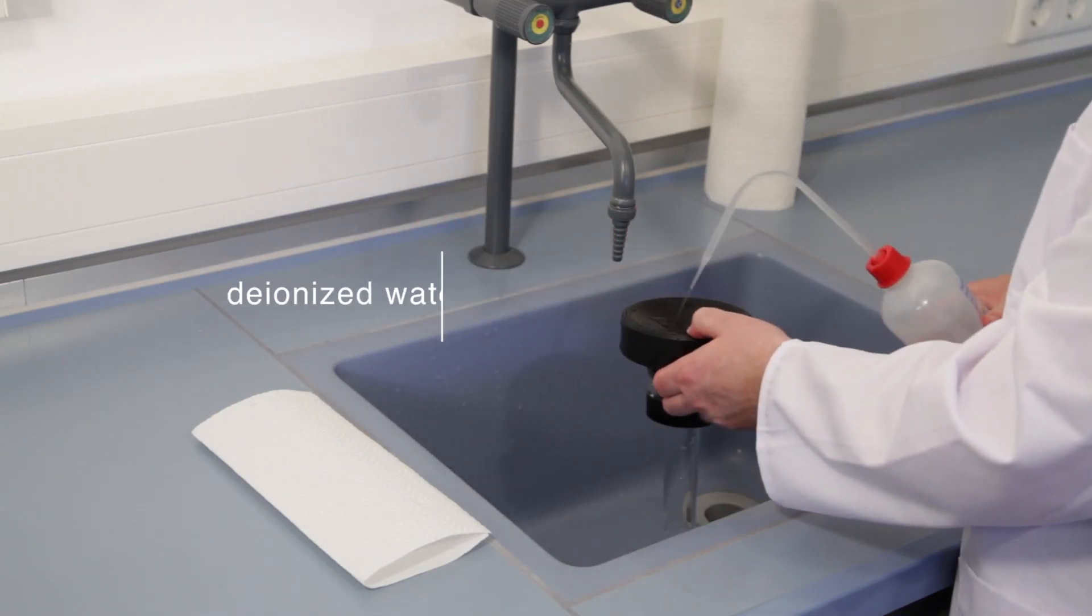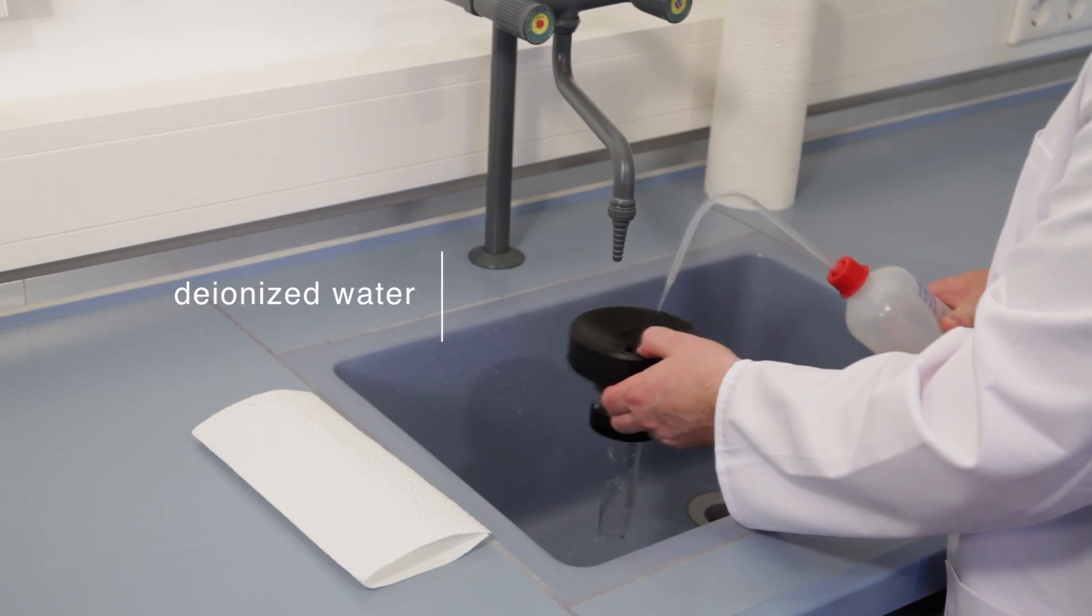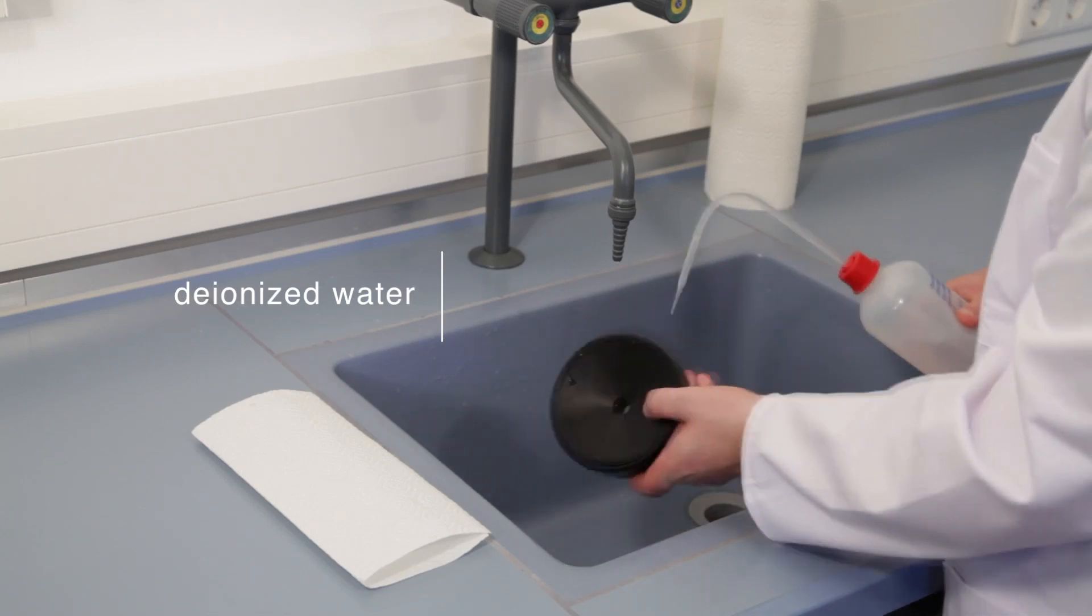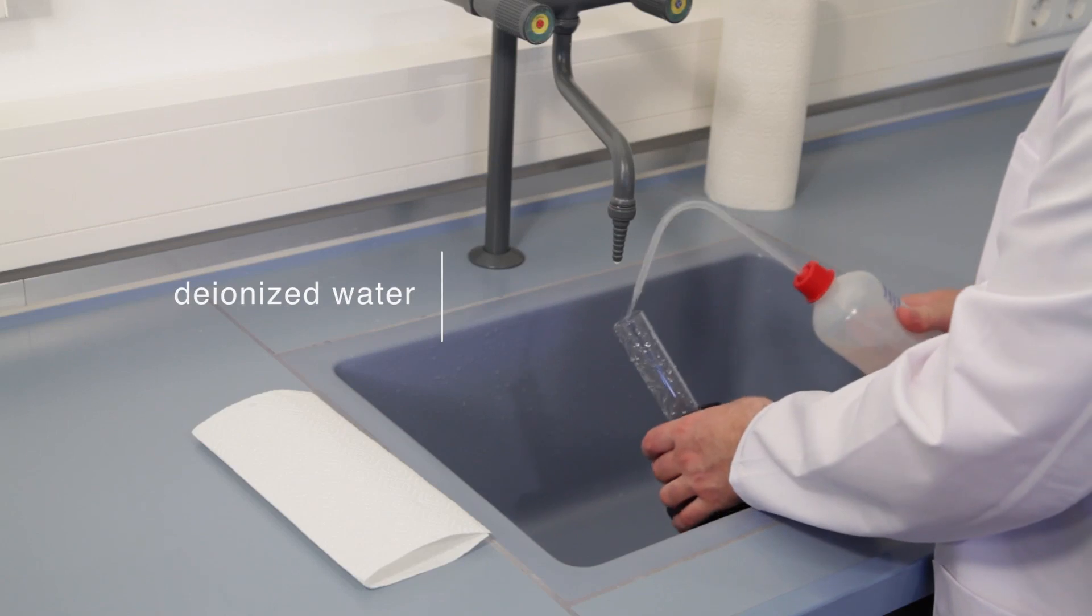Rinse the measuring cell also with deionized water to remove ions that could have been introduced into the cell with the tap water.